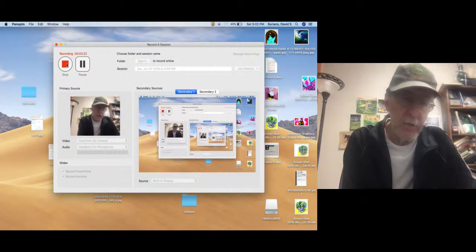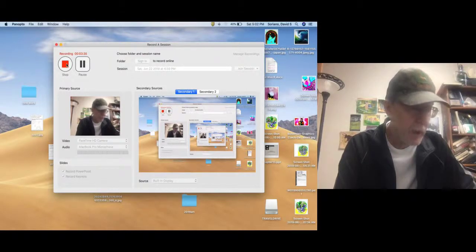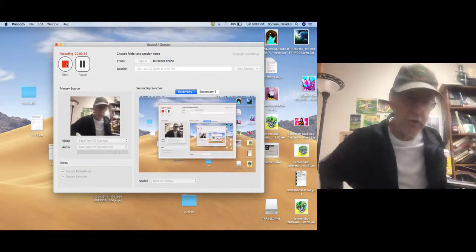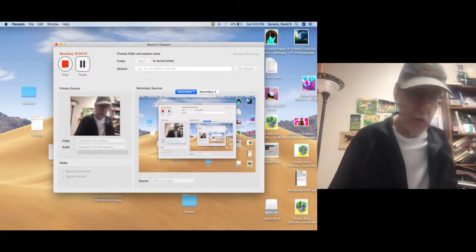I work with production of both azo dyes, the water soluble forms, and the pigment forms that are not. You can get some beautiful yellows, reds, oranges, browns. This video will focus on two novel methods of making azos. There are chemistry professors throughout the world that may be interested in one of these techniques for carrying out azo production, which typically is carried out with harsh acid and proceeds through the diazoniums, many of which are unstable and have been known to explode.